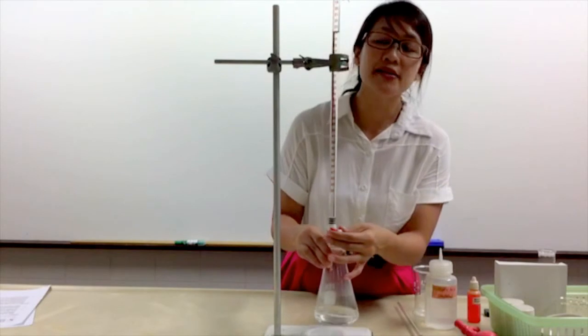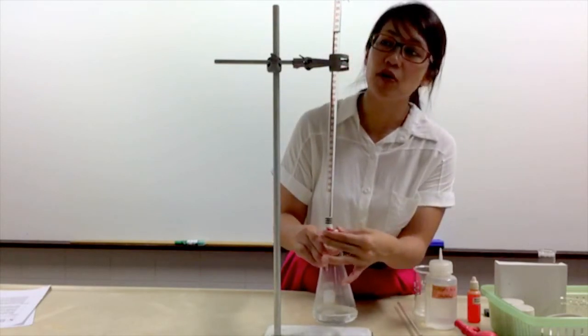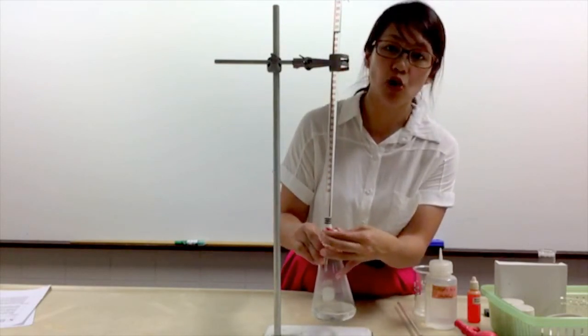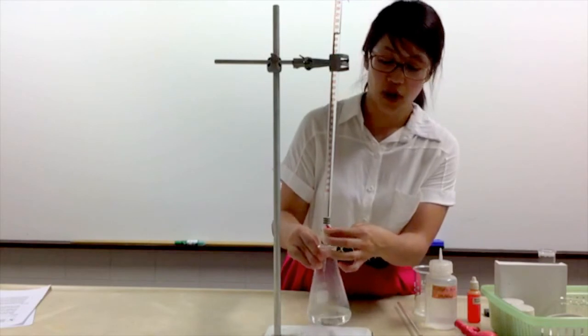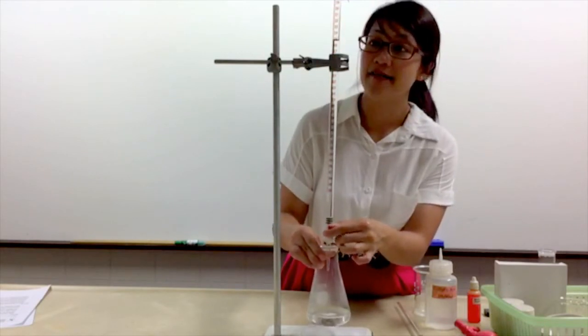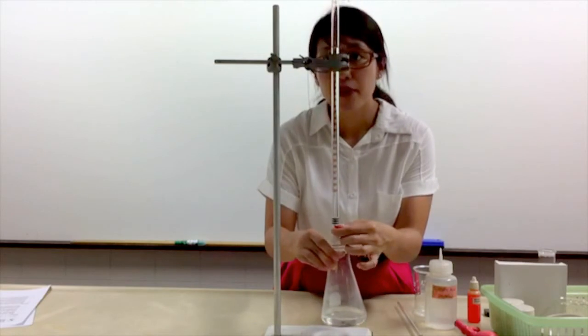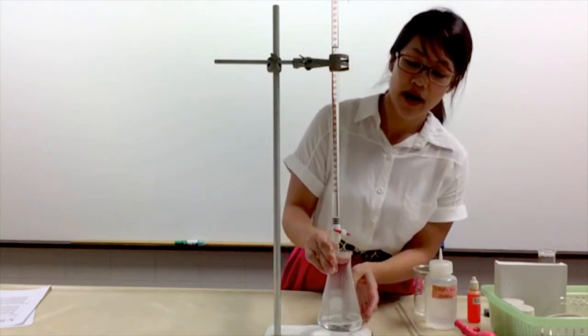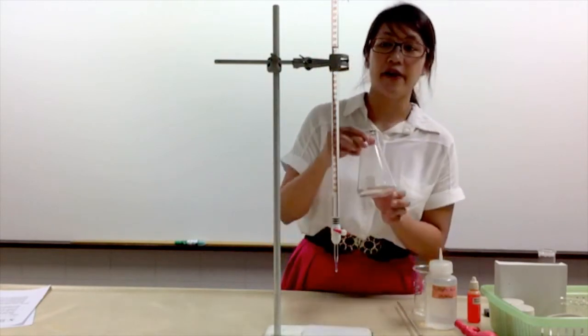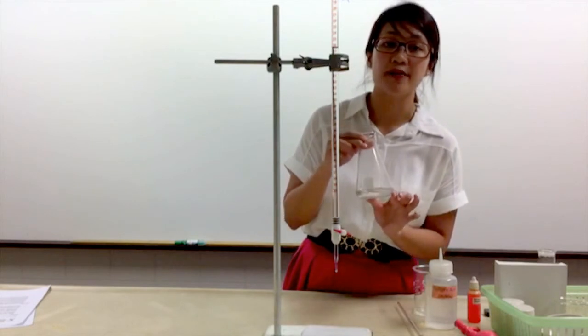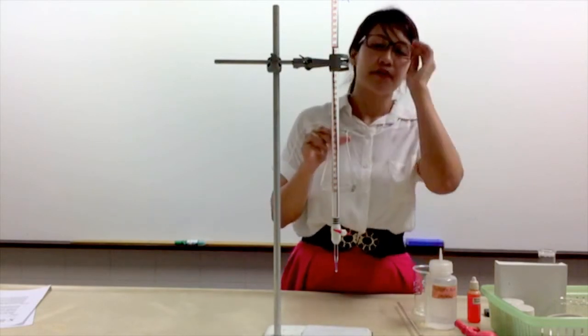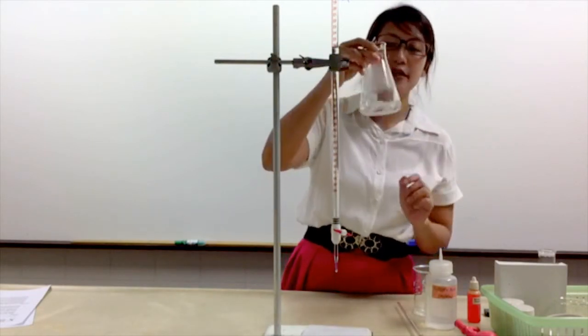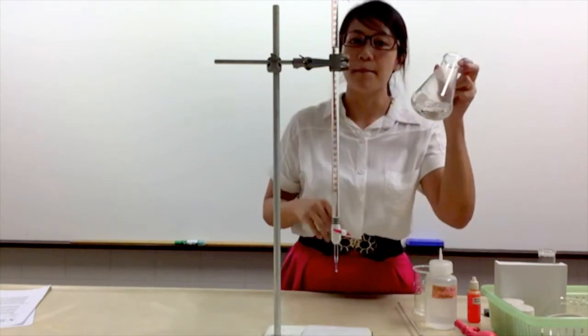Once it reaches about 25 cm³, you need to add your alkaline drop by drop so that you will not exceed the value that you need. I have added 26.2 cm³ of alkaline.